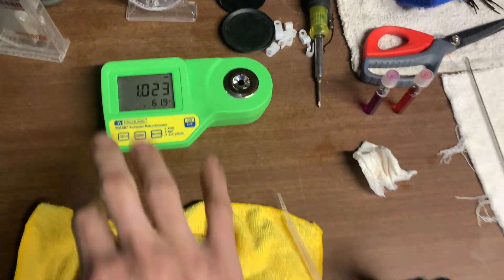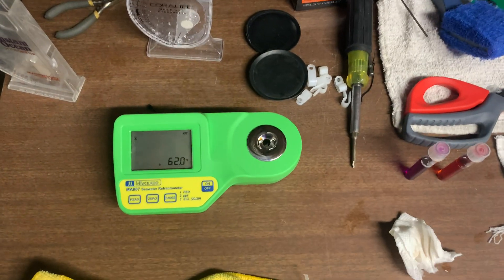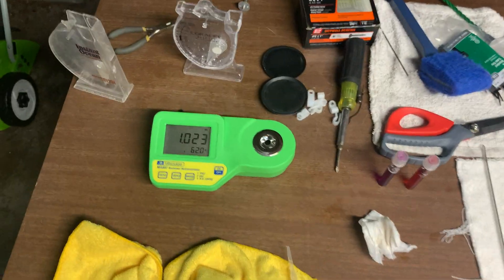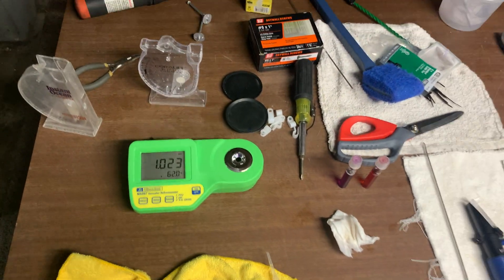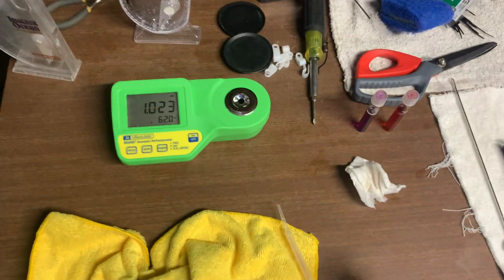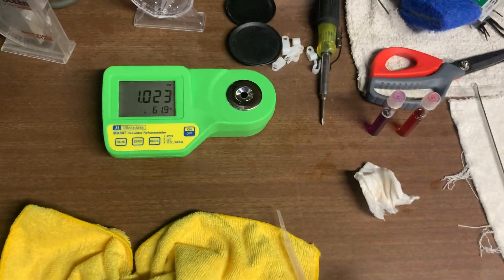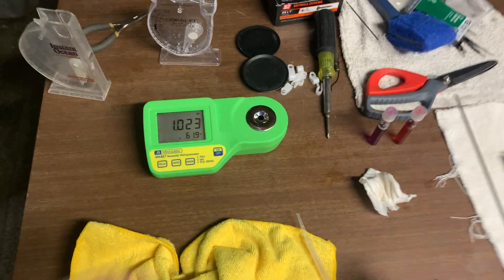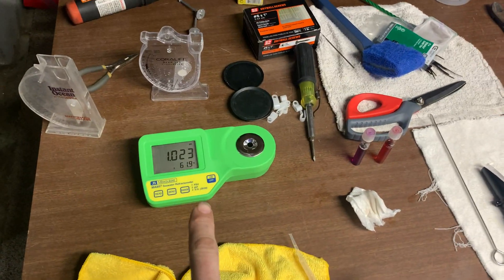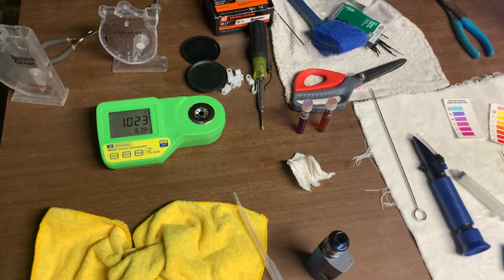It read a little higher, but take it with a grain of salt. This thing got good reviews. A lot of people said you have to calibrate it every single time you use it — that is not true. I calibrated it once. I've had it for days now and I've used it every day about 15 to 20 times with no issues. Calibration is spot on. And the best thing about this meter is it just uses distilled water for calibration. You don't have to buy any expensive things.